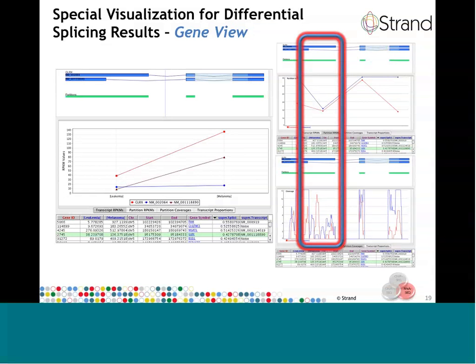And as you can clearly see, the coverage line is much lower for the extended part of the exon in both conditions, providing us with the evidence that the longer version of the transcript does not show any change in expression from one sample to the next. Therefore, it must follow that the higher expression level we see for gene GLRX is caused by the higher expression of the other shorter transcript.